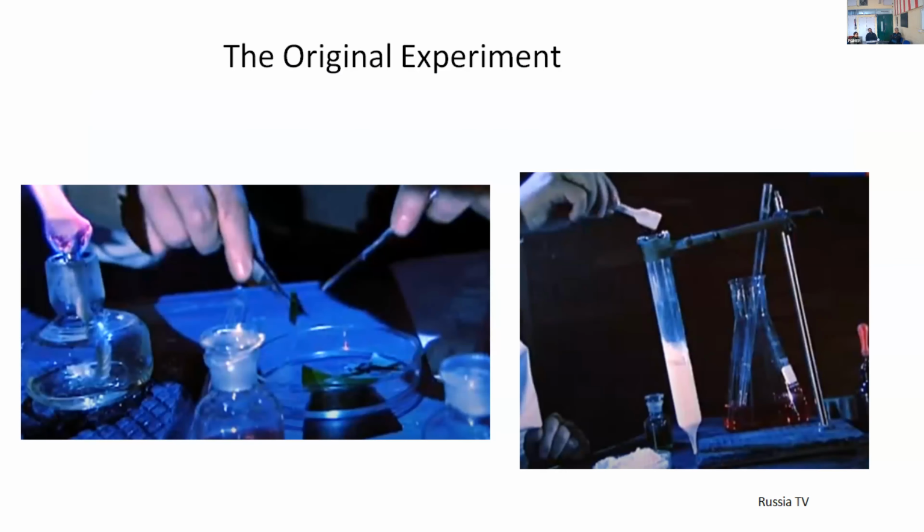He took chlorophyll and dissolved it in a solvent, took a test tube, closed down one end or made it very narrow, filled the test tube with chalk and poured the mixture of alcohol and chlorophyll on top. And after that, he added more alcohol.